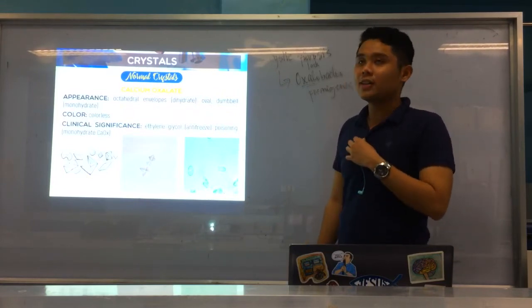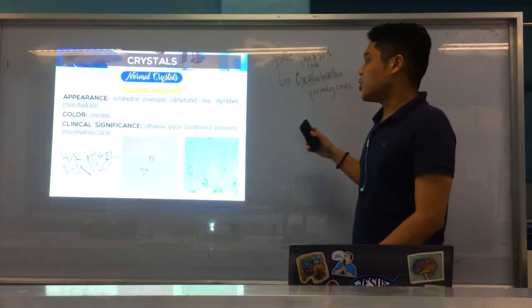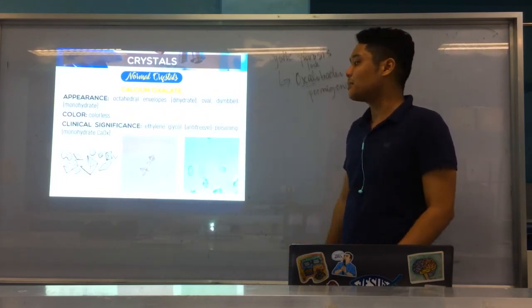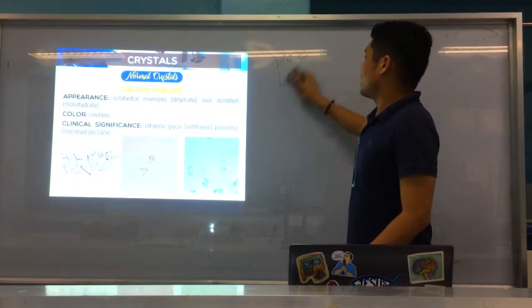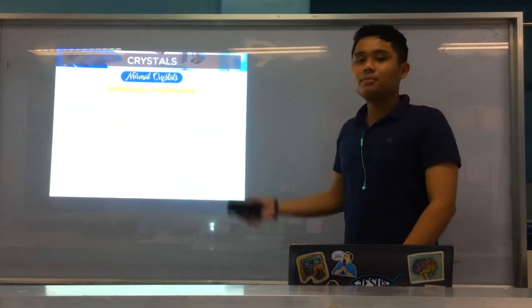Just to recall, dihydrate is the most common, envelope shape, also known as weddellite. And you have monohydrate, dumbbell shape. Dumbbell or oval shape. Usually seen in ethylene glycol poisoning, anti-freeze poisoning. And what is the other name? Whewellite. Okay. Alright. Now we go to your alkaline urine.